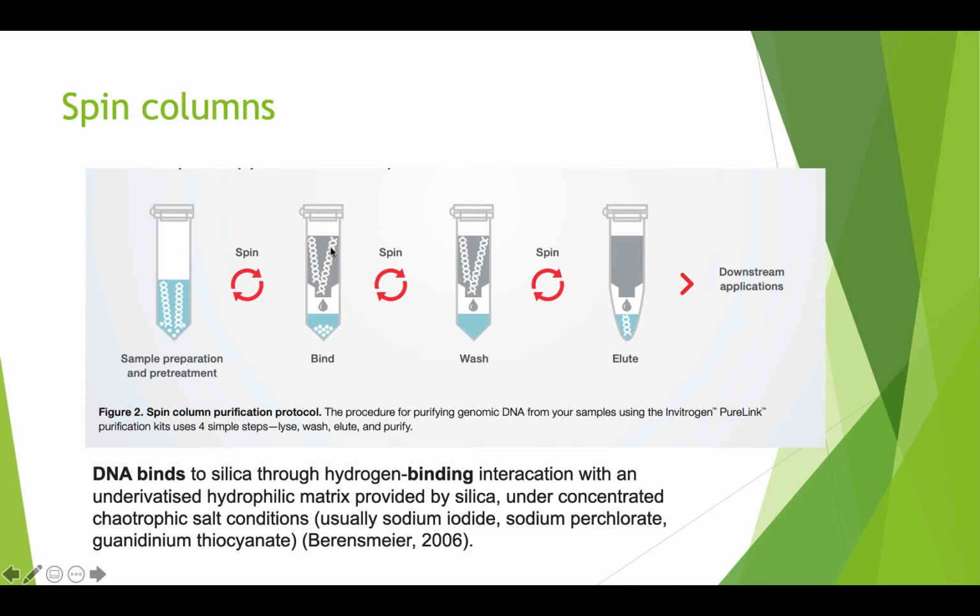You give it time to incubate a little bit and let it bind, and then you put wash buffer, and all the cellular debris and all the salts will go down, and all the DNA will bind to the silica. They tell you there are a lot of theories on why DNA binds to silica. There are a lot of theories.